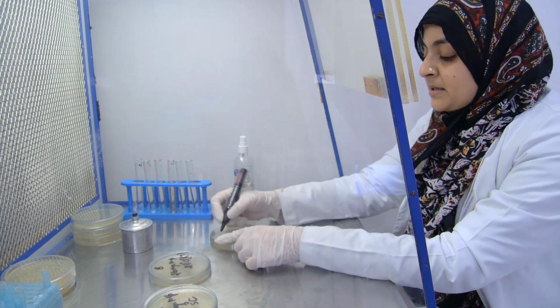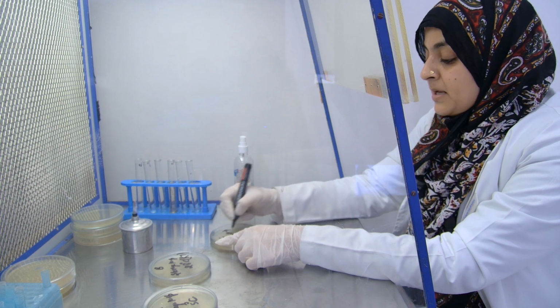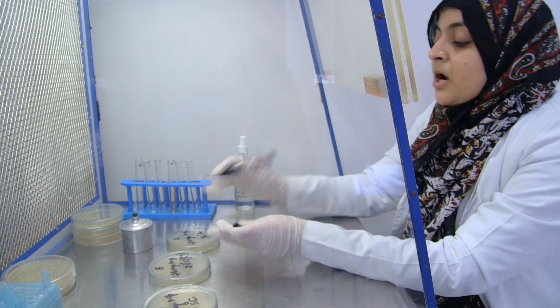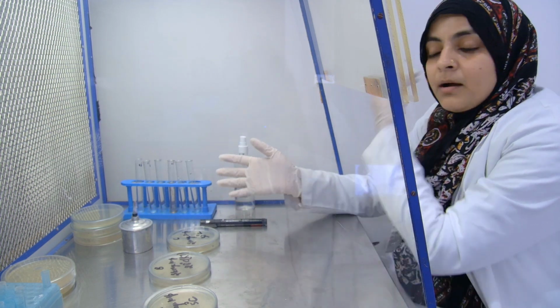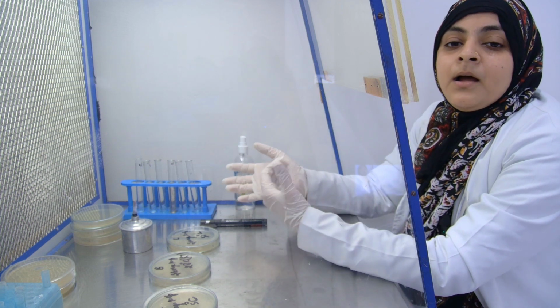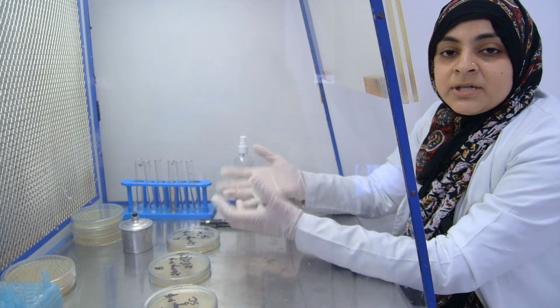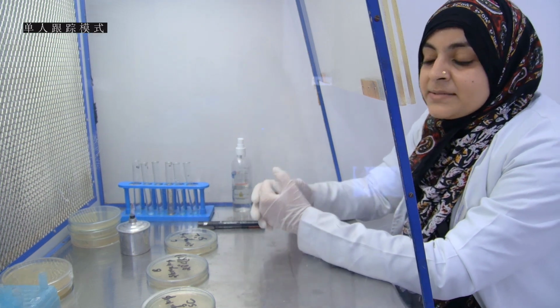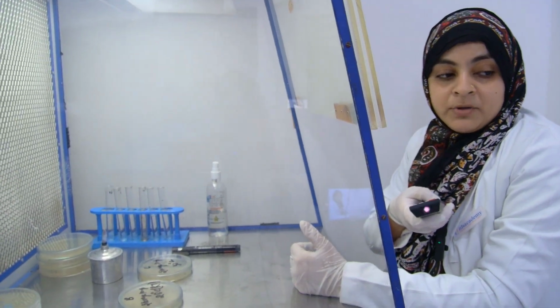Now the third plate is C, storage temperature 37 degrees Celsius. Now what we have to do, we take this from a serial diluted tube, we take a solution, or you can say that we take a microbial culture, microorganisms, and then we inoculate this into a Petri plate.